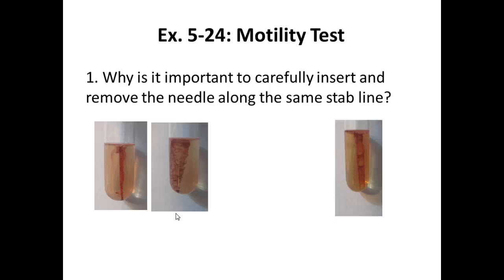If you have one of these flat planes, or a spread plane, you need to indicate that. But remember that this is an inoculation problem, so don't record this as positive, because if you did, it would be a false positive.